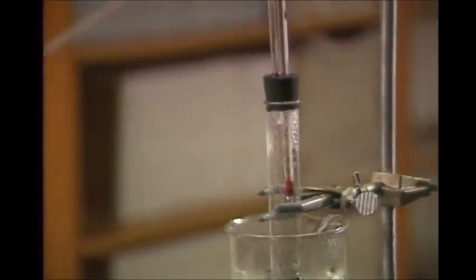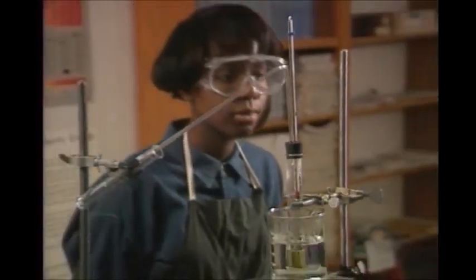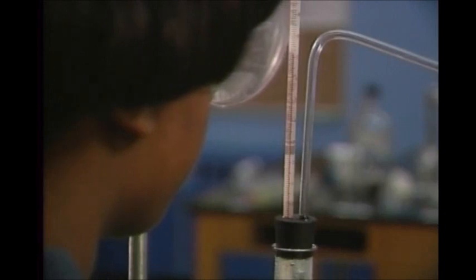Thermometers are one of the most important tools in the chemistry laboratory. They're easy to use, but since they're usually made of glass, they have to be handled properly.